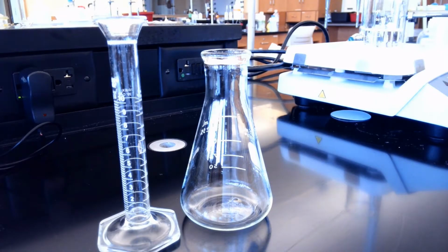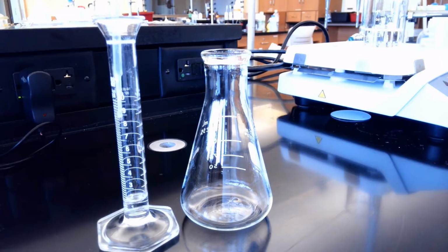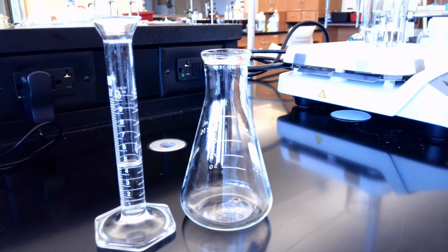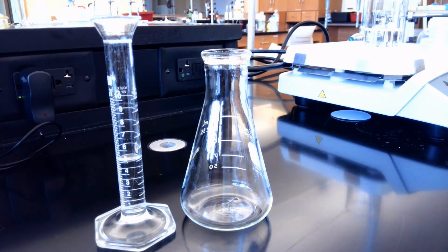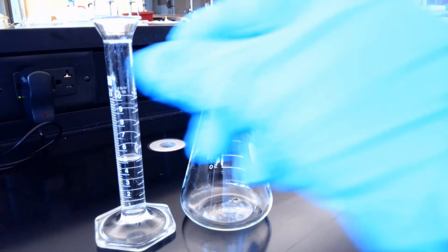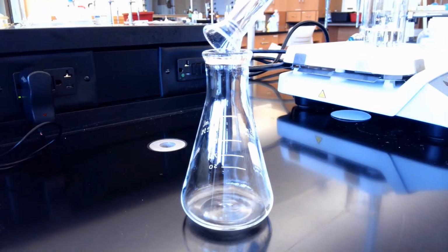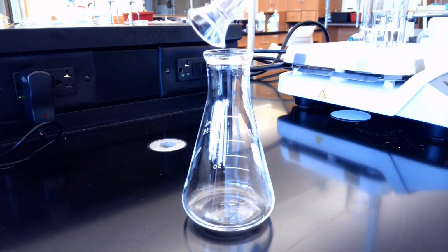We are now going to take 5 mils of our unknown liquid. We're going to measure it out, and we're going to add it to the flask. So there we are at 5. Get it all in.